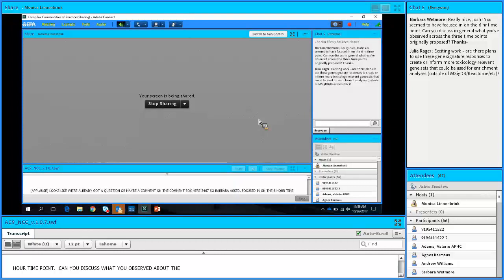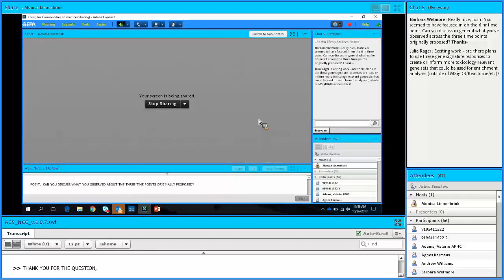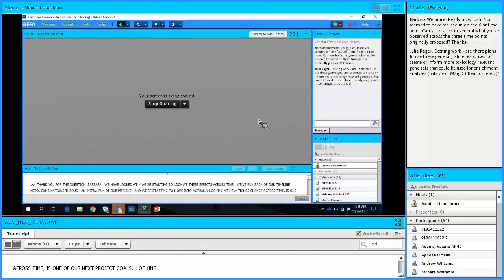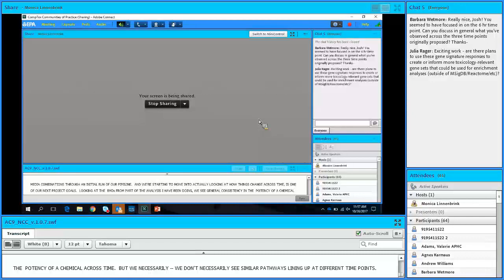Okay, thanks for the question, Barbara. We're starting to look at these effects across time. We've run each of our time by media combinations through an initial run of our pipeline, and we're starting to move into actually looking at how things change across time as one of our next project goals. What I can say, just looking at the BMDs from the part of the analysis I've been doing, is that we see general consistency in the potency of a chemical across time, but we don't necessarily see similar pathways lining up at different time points. So we're still in the baby steps of evaluating why that may be or what's really going on there.